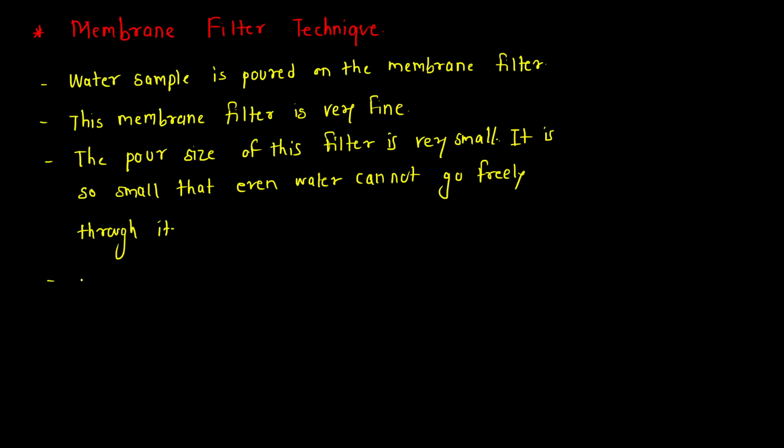Now on this filter, food specially for coliforms is placed.